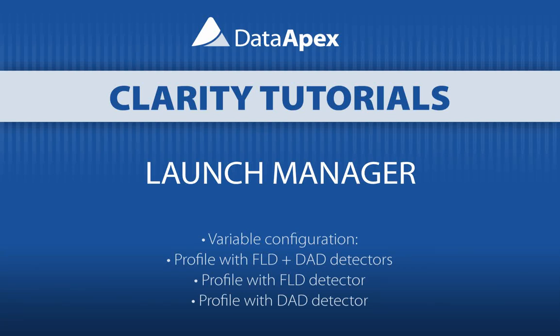My name is Marek, and today I will show you how to start Clarity with a variable configuration, including predefined instrument and respective projects, methods or sequences.